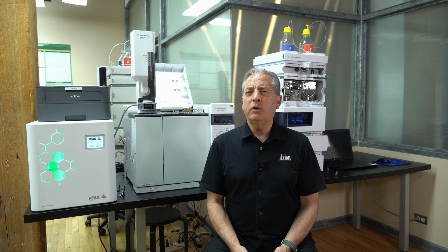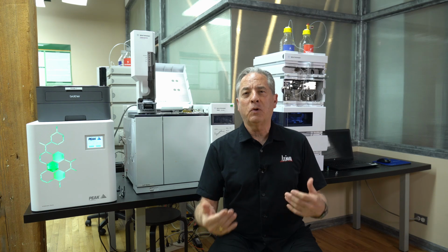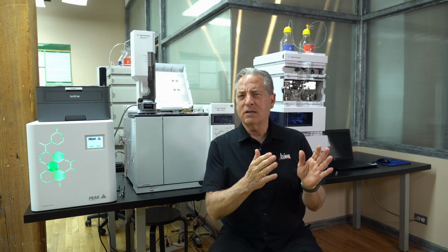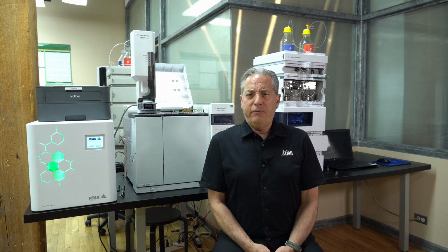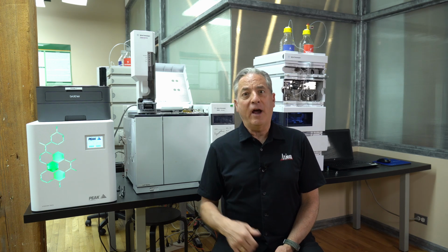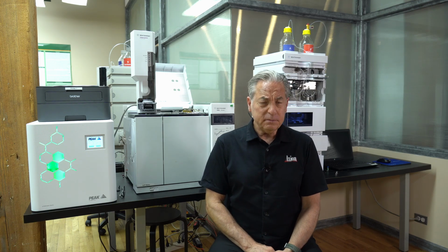Typically you would have a standard and you would run it before you run your sample, and if all the parameters check out, then the system is ready to accept the samples. If you want more detail on system suitability, you should check out our Axion Lite, where I'll go into a deeper dive.